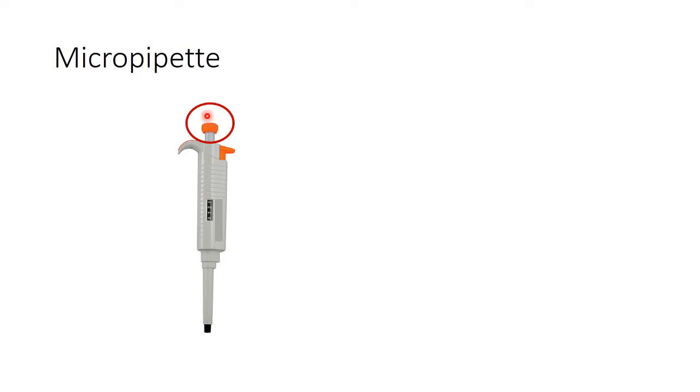The second important function is it helps to set the desired volume. By rotating the plunger, the desired volume can be achieved with a click sound for every increment or decrease in volume. If we rotate the plunger clockwise, we can increase the volume and if we rotate it anticlockwise, we can achieve a decrease in the volume.